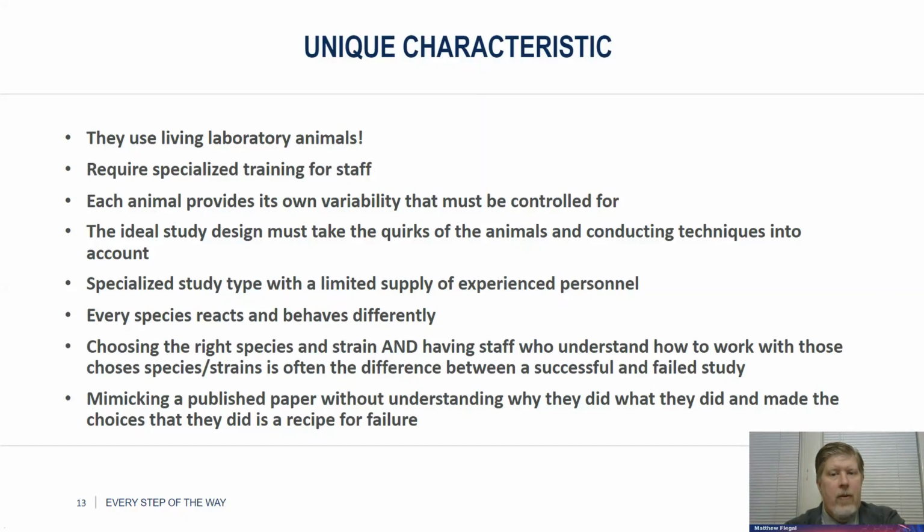So choosing that right species and the correct strain and having staff who understand how to work with those species and those strains is usually, I say often, but I'm going to edit that to usually, the difference between a successful and a failed study, even a partially failed study.